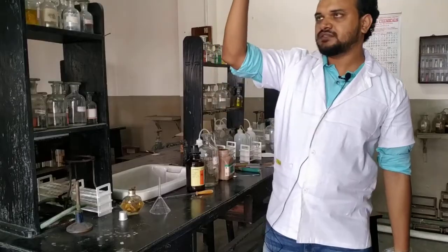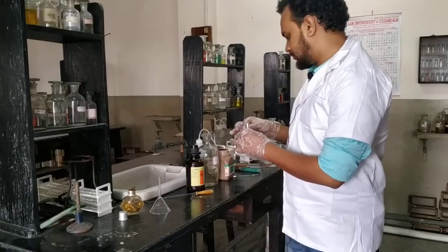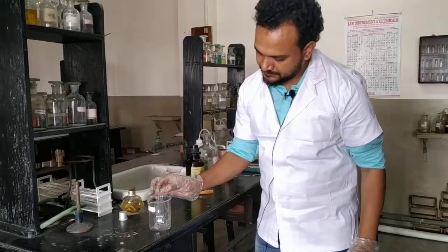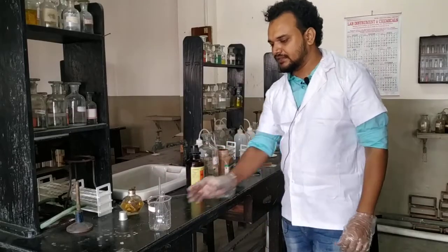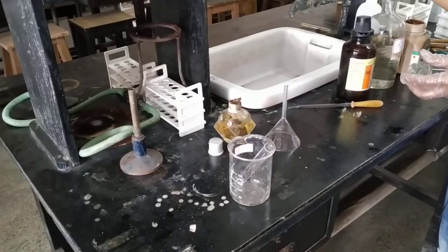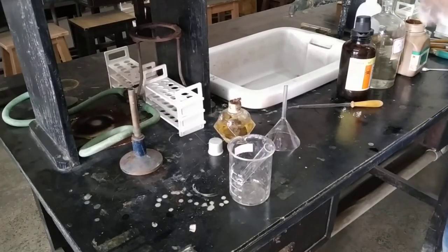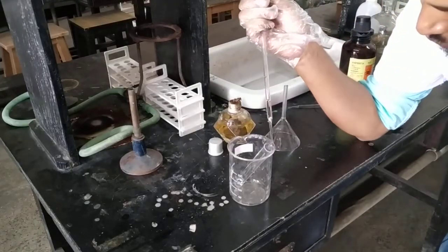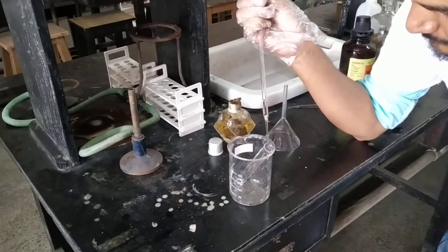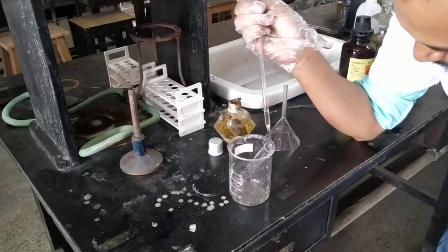Now it is completely dissolved — a clear, transparent solution. Now for the addition: take a beaker, hold the test tube like this, and now I will add the concentrated H₂SO₄. See how I add it along the wall of the test tube, drop by drop, along the walls so that it rolls down.